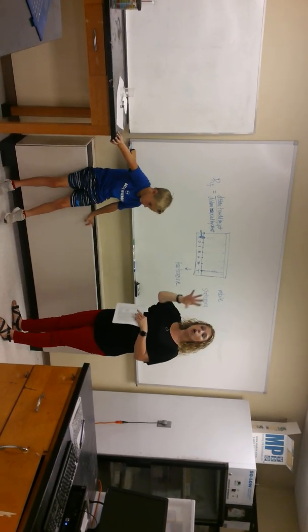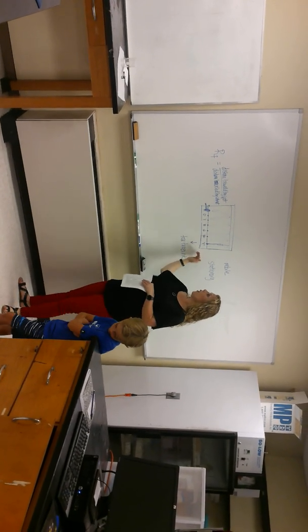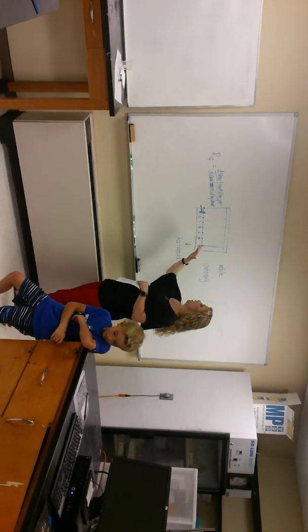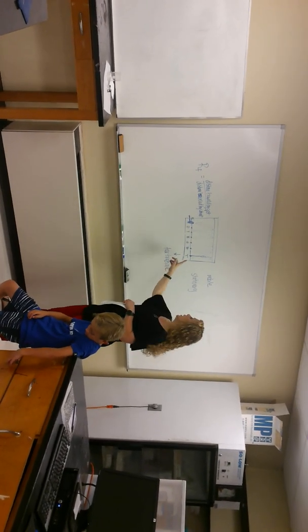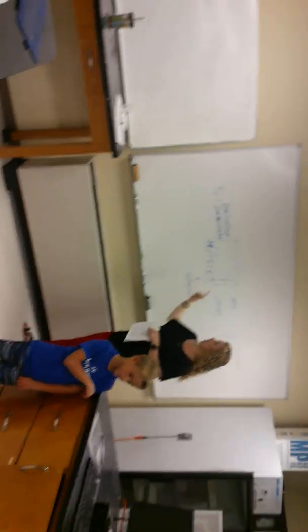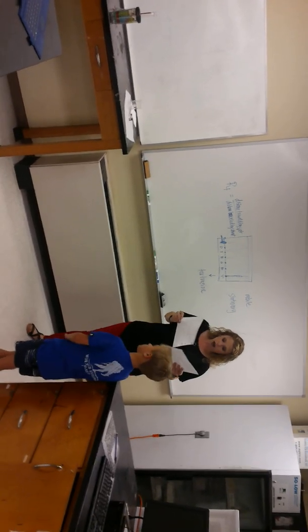So you're going to show all of the RF calculations, and then you're going to answer that question about which ones your friend cannot eat and which ones they can eat. Again, tartrazine being our standard, it is our yellow dye number 5. Okay? All right, so that is our paper chromatography lab.